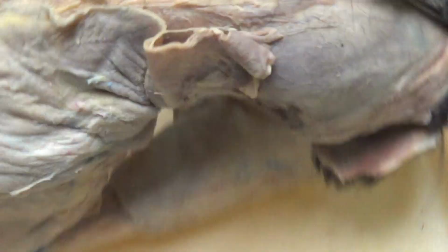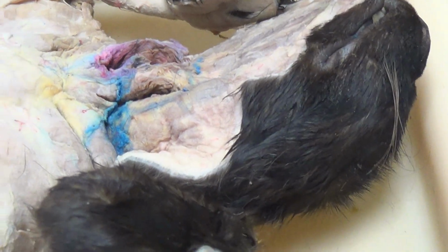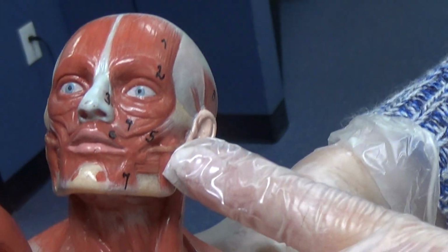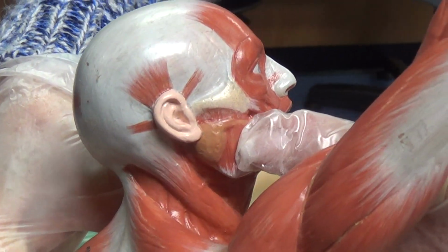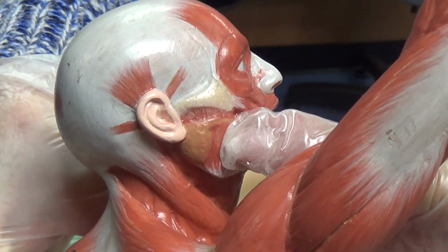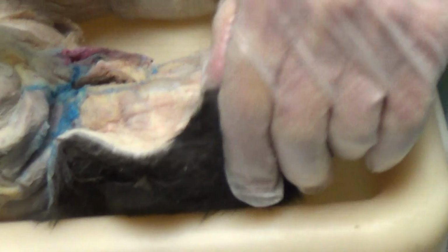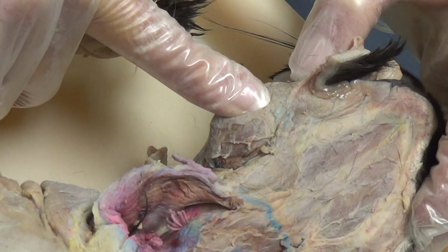Okay, masseter. This is a thick muscle of the jaw inferior to the ear. It originates on the zygomatic arch and inserts on the mandible. Its purpose is to raise the jaw. On the kitty, usually it's not deceptive. Out here, this is the big fat cheek.